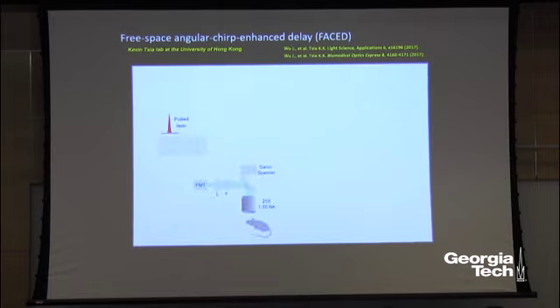Now, what is this method about? I have to admit to you that when I look at the name, even though I'm trained as a physicist, I have no idea what this method is. But the concept is actually very simple. As I mentioned to you before, for 2 photons, the way we form an image is to send a laser, and it's always a pulsed laser, through the objective into the brain, and you will have a galvo scanner to scan this focus to form an image, right?